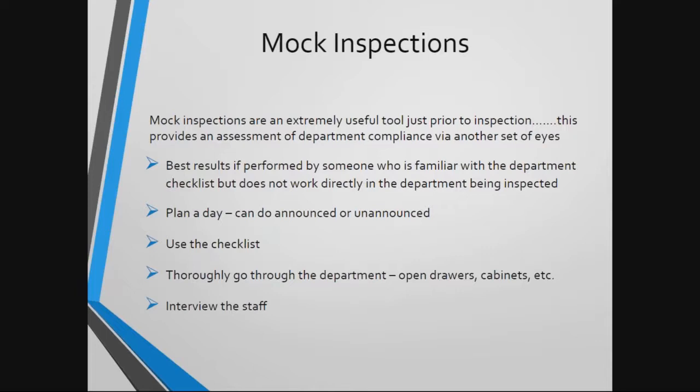If you don't have time to go through the entire checklist, even doing a random sample of the requirements is helpful. Sometimes this can just focus on those heavy hitters as far as deficiencies that are frequently seen, or you can look at deficiencies that have occurred in the past in that department, whether it's histology or cytology. These are just effective whether they're performed announced, so the supervisor knows when the mock will be performed, or if they're unannounced, where we just show up one day. A lot of times we will do this announced simply for scheduling purposes, but either way, it works.